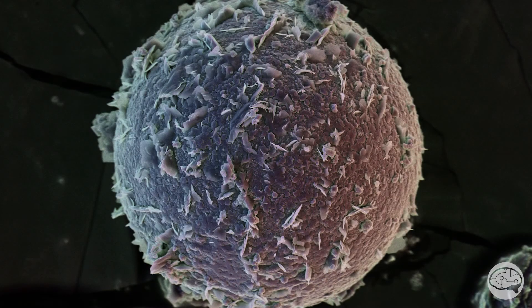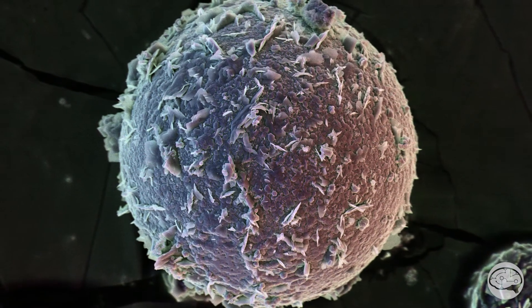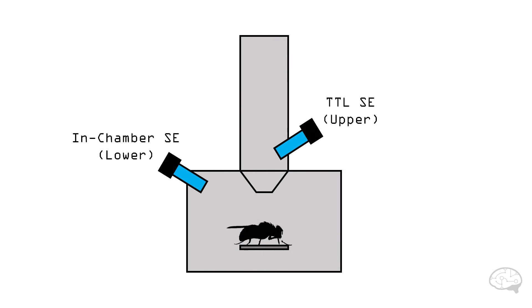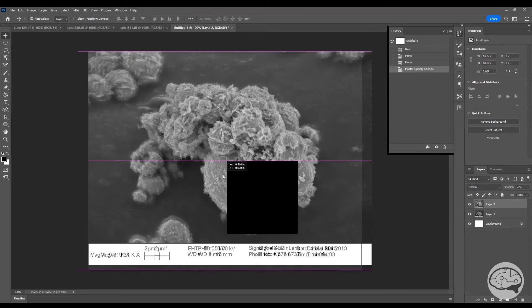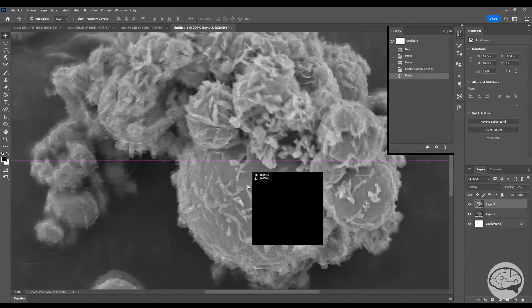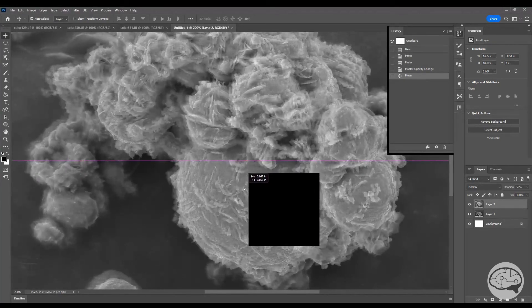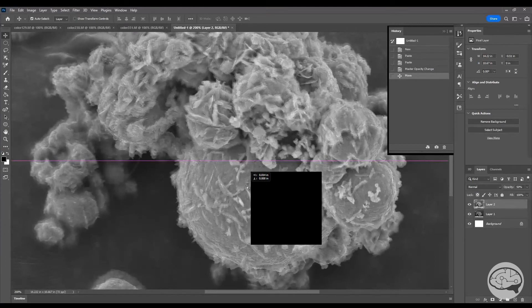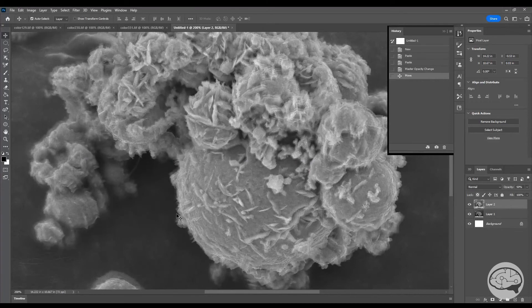I was surprised that this mostly worked, but there are some potential issues. Images from an upper and lower detector are not going to match up exactly. There will be some amount of distortion between the two. For example, with the Hitachi Cold Source FE SEM, I was able to get away with this technique fairly easily, as the images generally matched pretty well. However, when I tried this with a Zeiss SEM with a Gemini column, the in-chamber and through the lens images were so different that there was no way to stretch the images enough to get them to align properly. Mainly what I'm trying to say is that using this process instead of the backscatter images will have varying degrees of success depending on which microscope you're using.